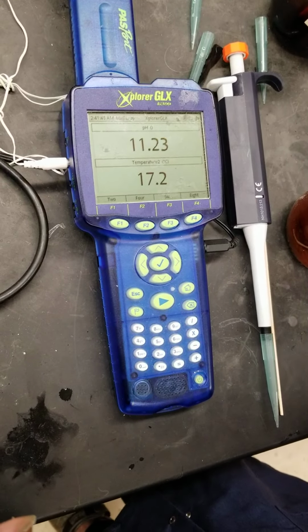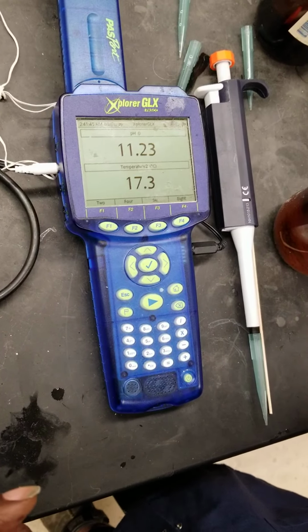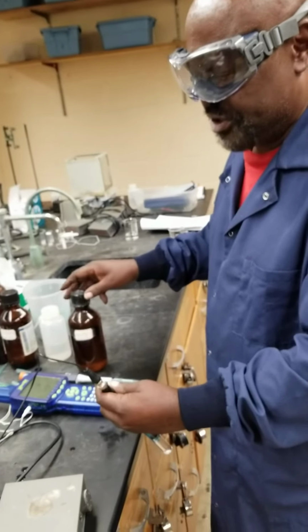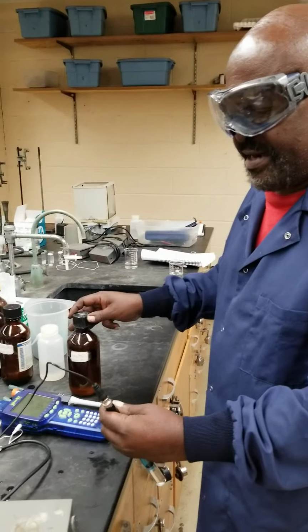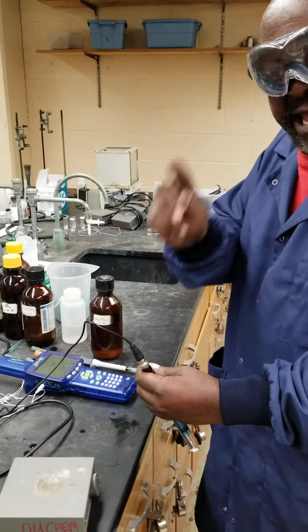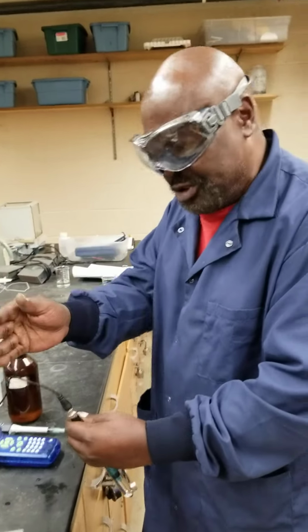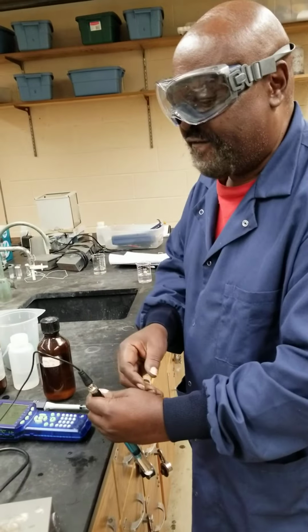Wait for that to stabilize. Let's read that as 11.23. That concludes the measurements in the lab. From these, you can determine the Ka of each acid, that is acetic acid, Ka for the ammonium ion, Ka1 for phosphoric acid, Ka2 for phosphoric acid, and Ka3 for phosphoric acid.